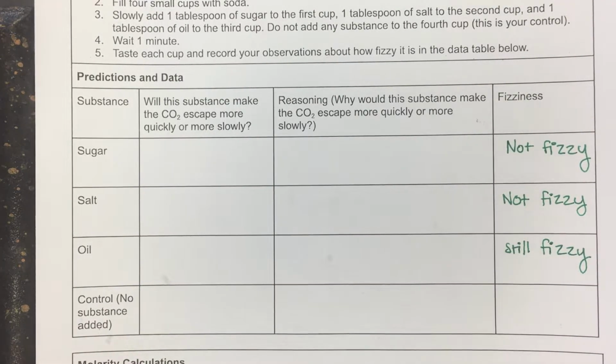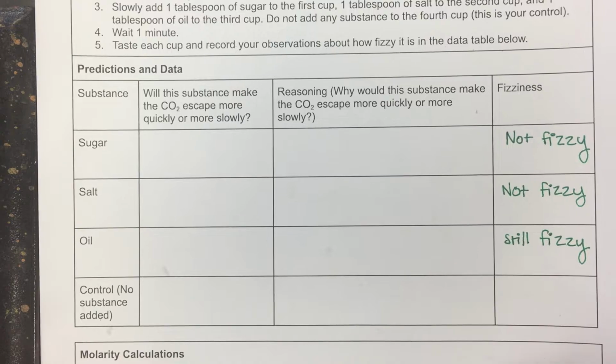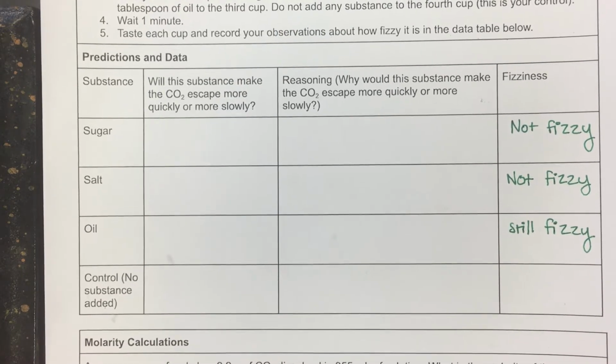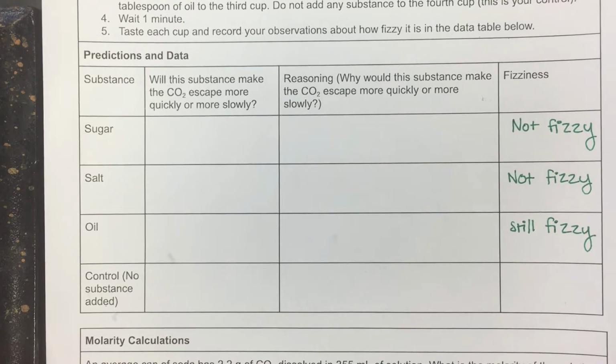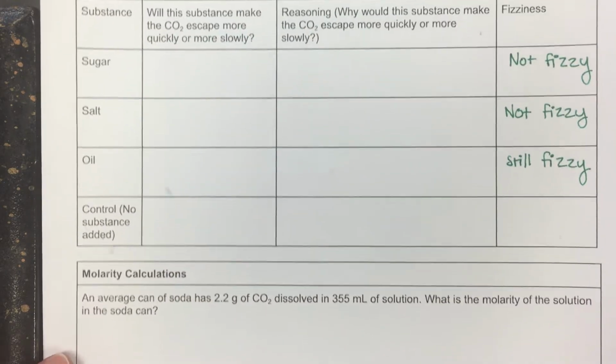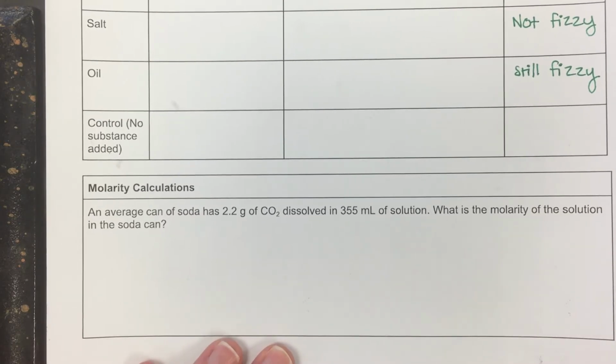Okay, so now we are going to take some quantitative data on what's going on here. And the first thing I want you to do is, hopefully you've watched the notes about molarity. If you haven't, you can watch them now.